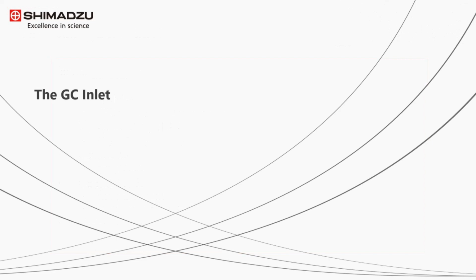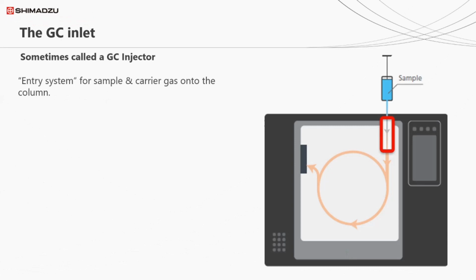So let's go back for a moment to session 1 and recap very quickly what the GC inlet does. The GC inlet, or injector as it's sometimes referred to, acts as an entry system into the column. It's where the liquid sample is introduced into the system via a syringe. As we discussed in the first session, a pressurised gas is needed in order for the GC to operate correctly, and this gas pressure is regulated by an electronic device, usually installed in the rear of the GC, called a flow controller.